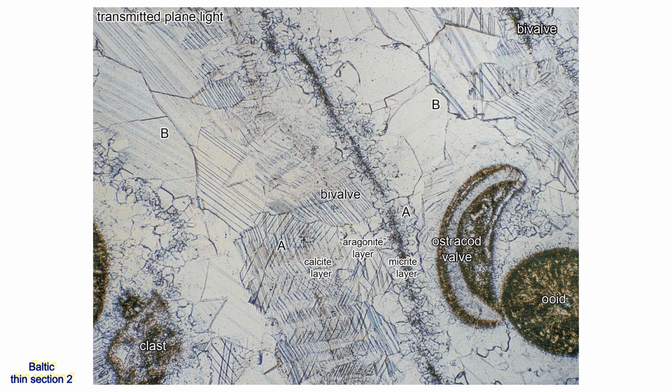The intergranular cement A crystals, as they grew away from micrite, developed a druzy fabric, while, as they grew away from the bivalve's prismatic layer, developed a columnar fabric. Cement A's fabric is controlled by the orientation and size of the crystals on which it seeds. Cement B follows cement A and completes the filling of all pores.